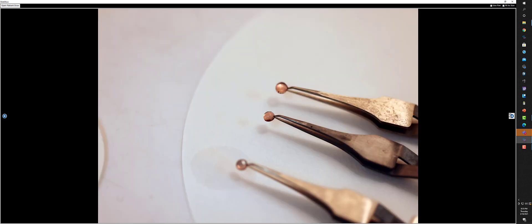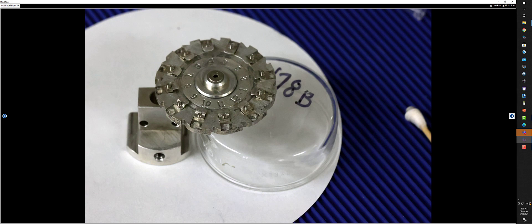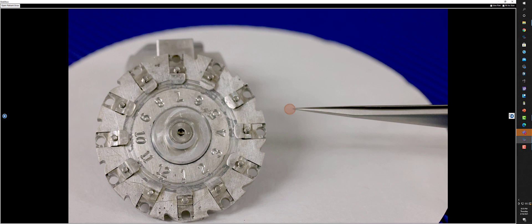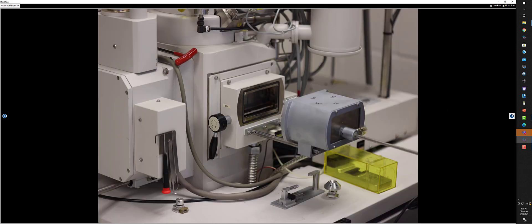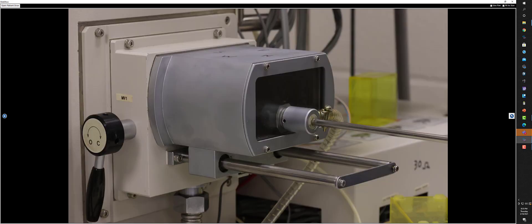Then you take them over to the staining sections. They have to be stained before you put them into the electron microscope. There's a whole staining procedure that's very rigorous. But you stain them, and then you put them in the holder for the electron microscope. This holder holds 12 grids. You put the grid in, and this clamps down on it. Then you take it and put it into your exchange unit. Then you close the door, create the vacuum.